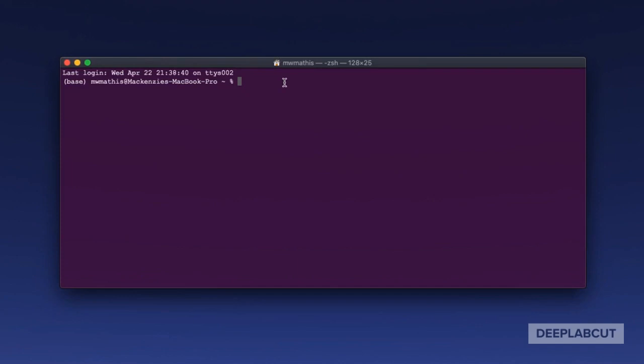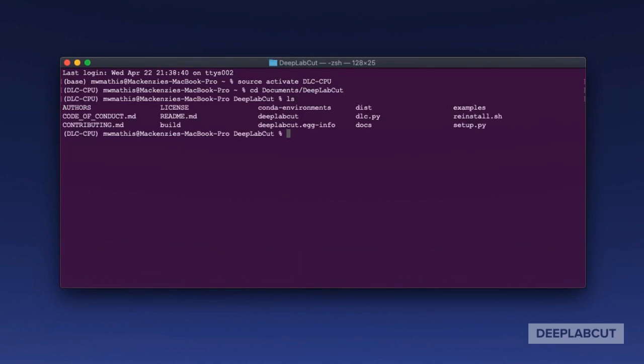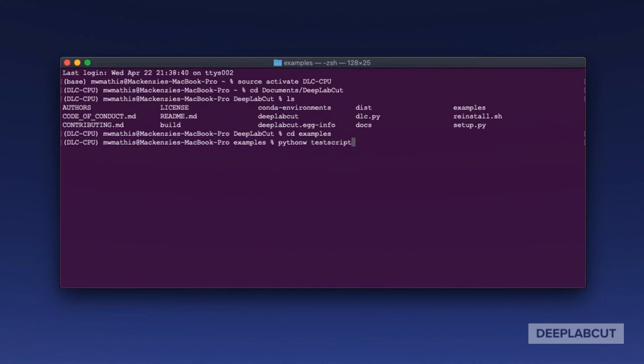Once you have that, let's go into the directory. I'm going to activate my Conda environment, go into the documents and into the DeepLabCut folder which I git cloned. Then I'm going to go into the examples folder, and we're going to type pythonw, or python if you're not on a Mac, and then testscript.py.